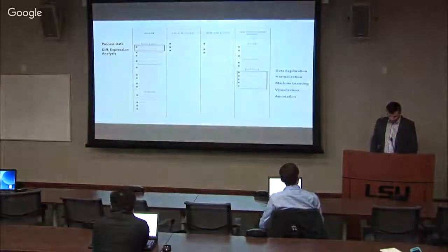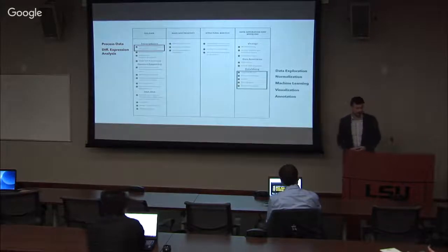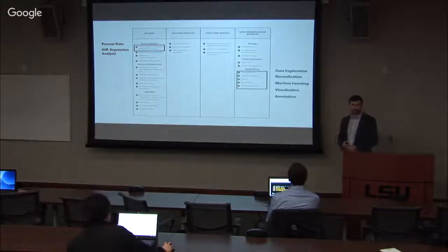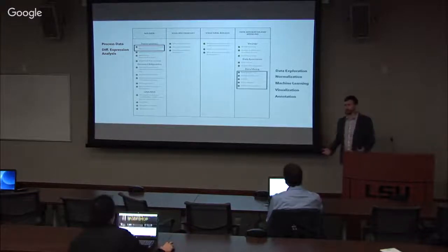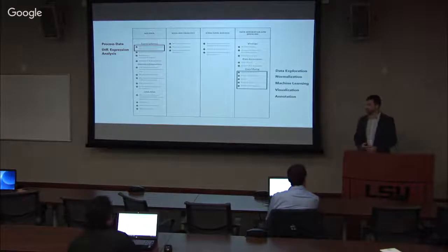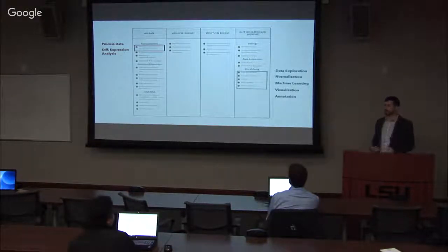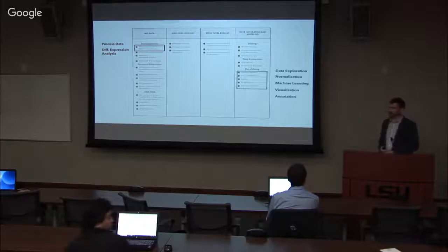Good morning. What we did last time for RNA-seq is we looked at basically processing the data. And we just assumed that processing the data with a standard pipeline will give us an informative enough output that we can take it to downstream analysis, doing some statistical analysis like differential gene expression, and then looked at different data mining techniques and interpretation.